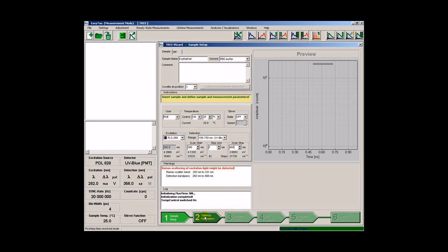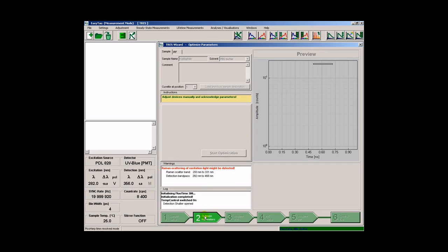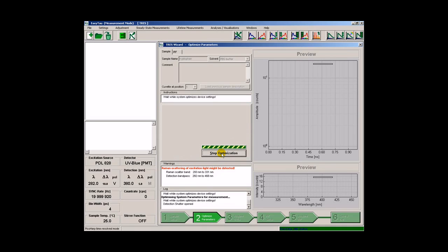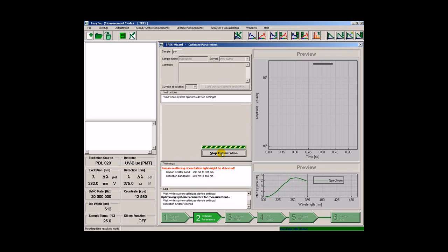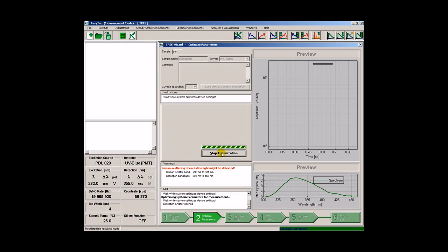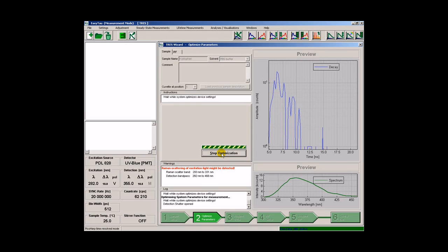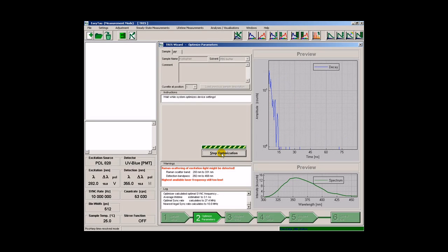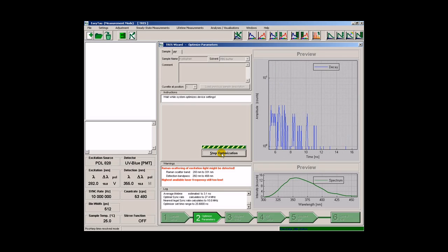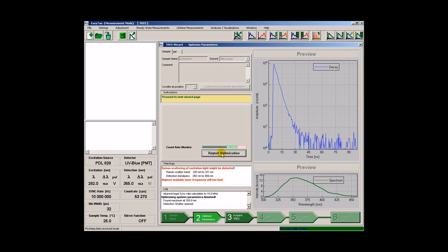We then proceed to optimize the parameters. In this step, the wizard will optimize various parameters automatically. First, it records a spectrum to find the emission maximum. Once the spectrum is recorded, it will move the monochromator to the maximum and optimize various DCS-PC settings, like repetition rate, monochromator slit width and so on.